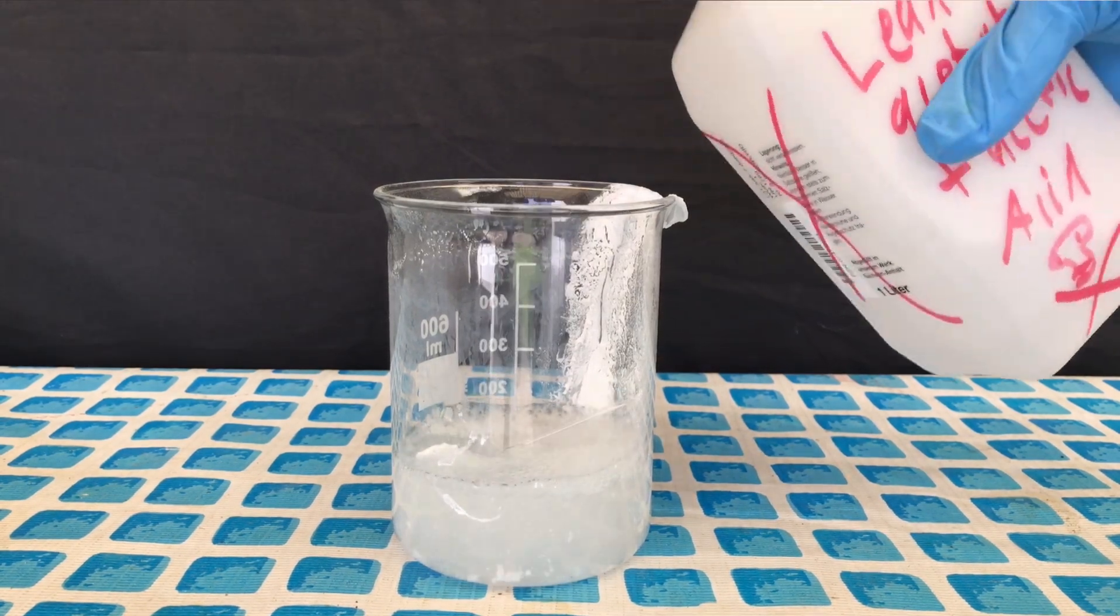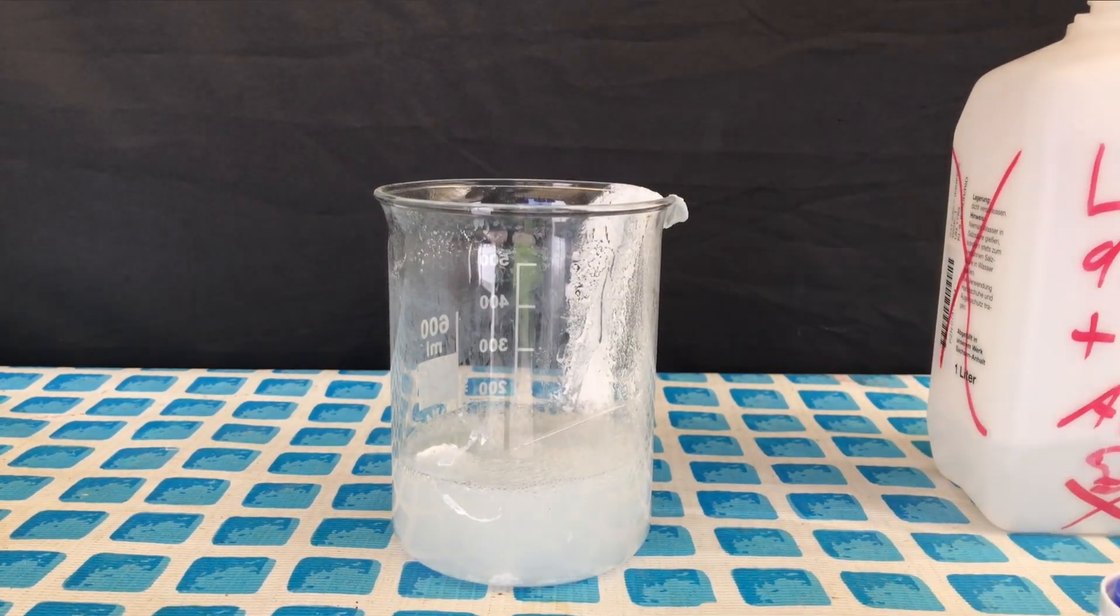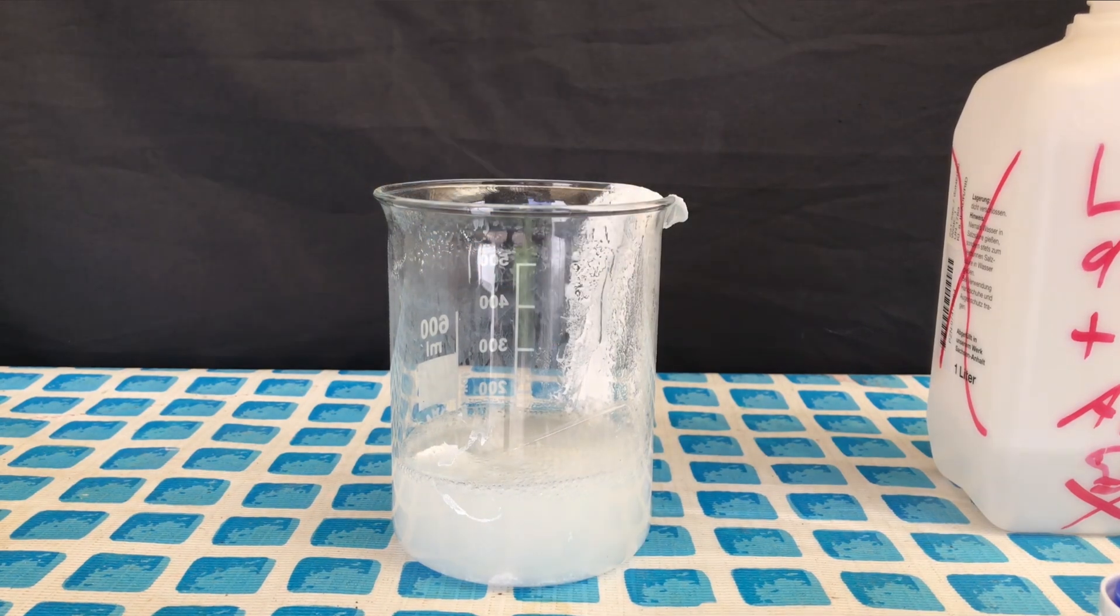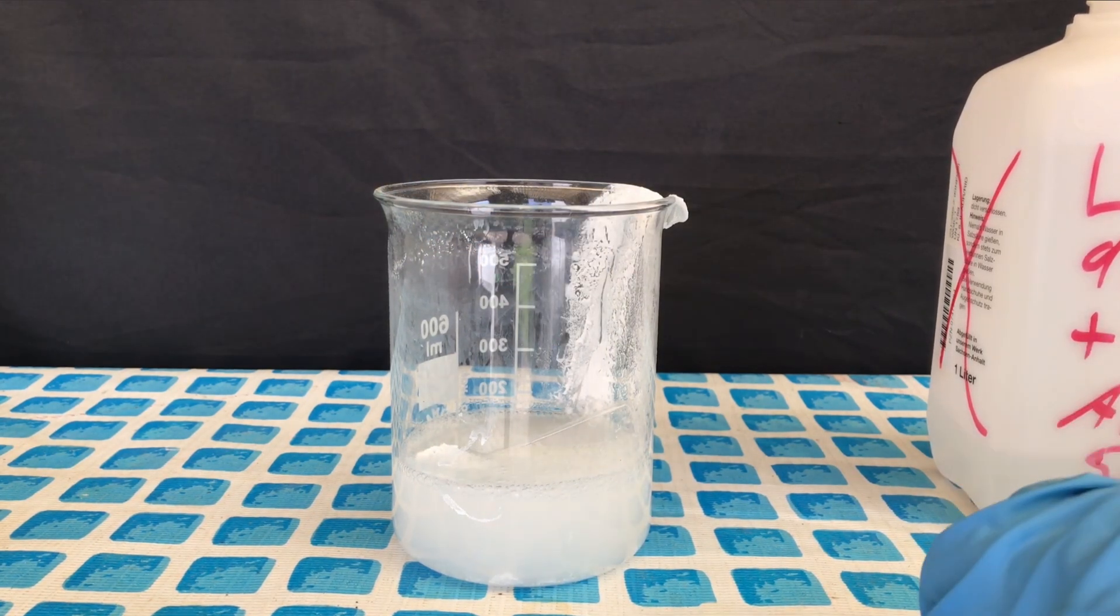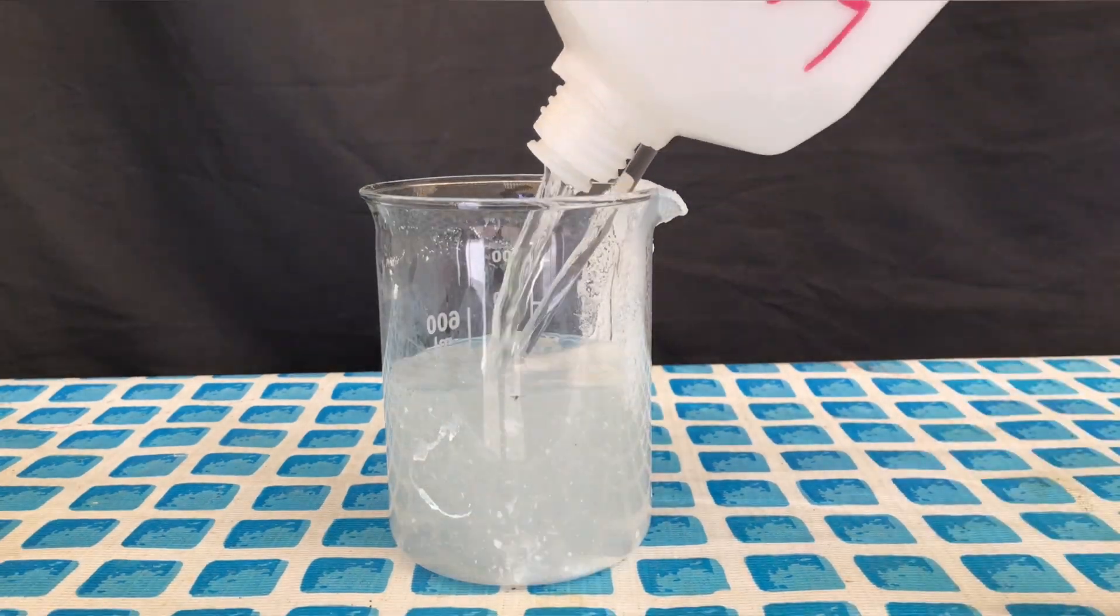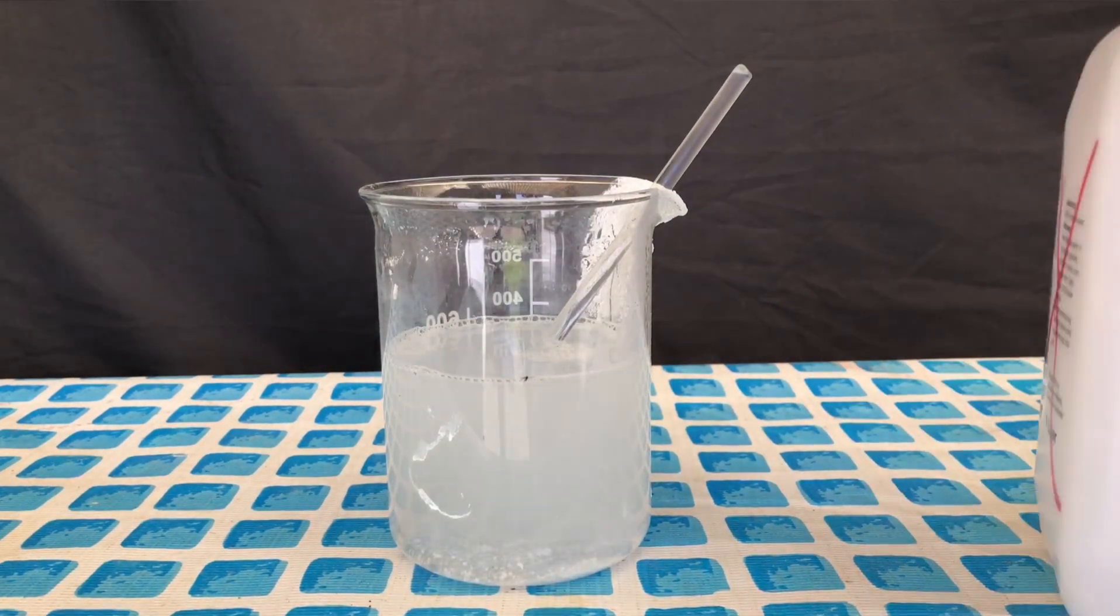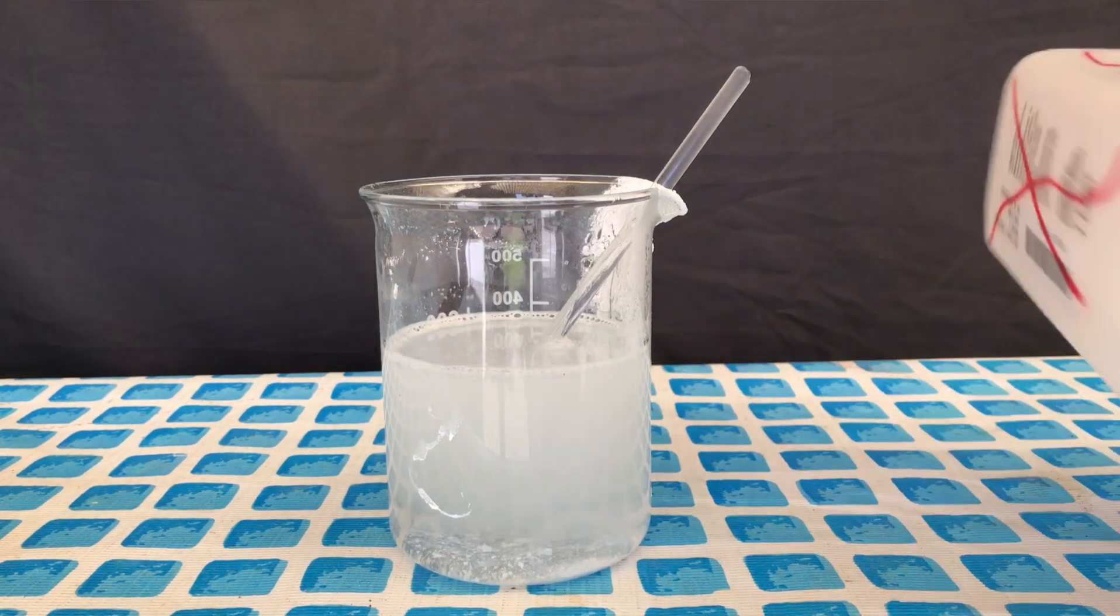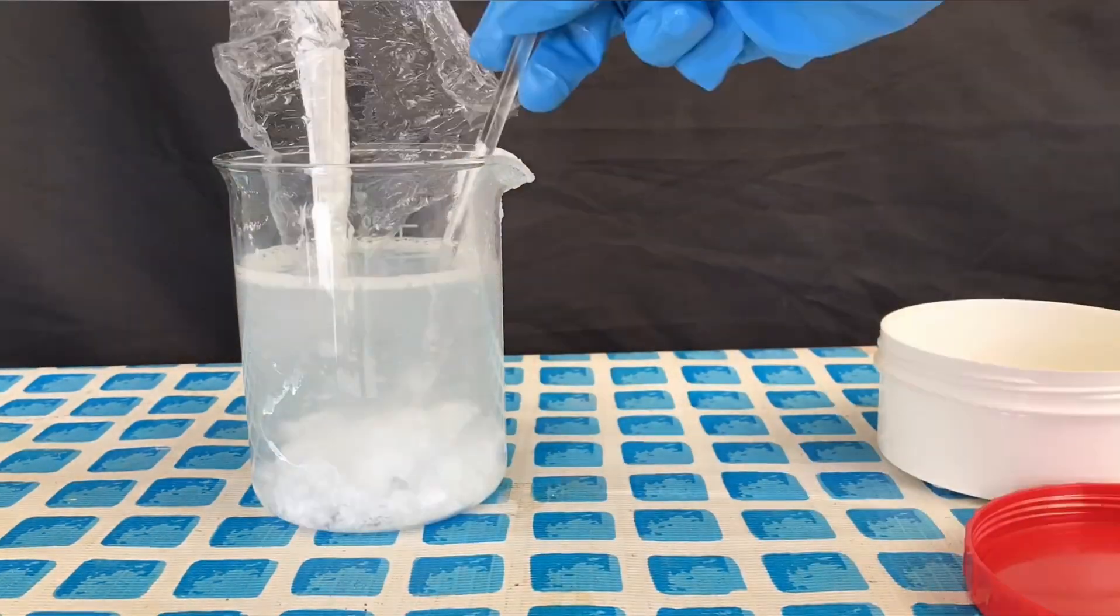The first objective therefore is to get all of the lead acetate into solution. Some lead acetate solution containing some acetic acid was added to the beaker. It took quite some time and a lot of stirring but in the end I managed to dissolve most of it. Some stayed undissolved but that shouldn't be a problem.